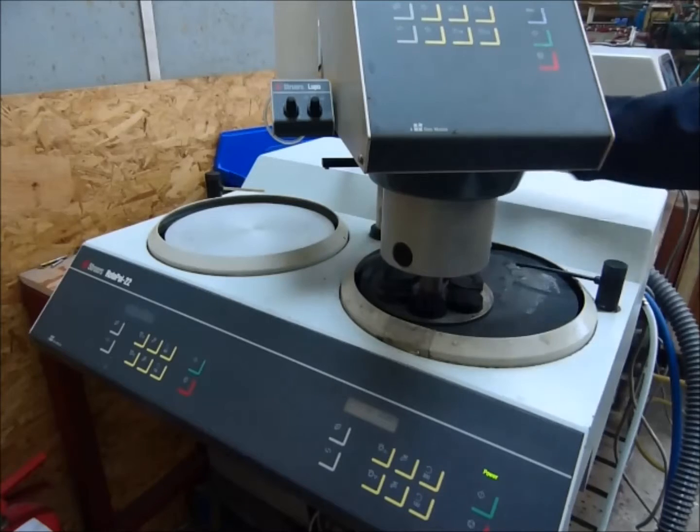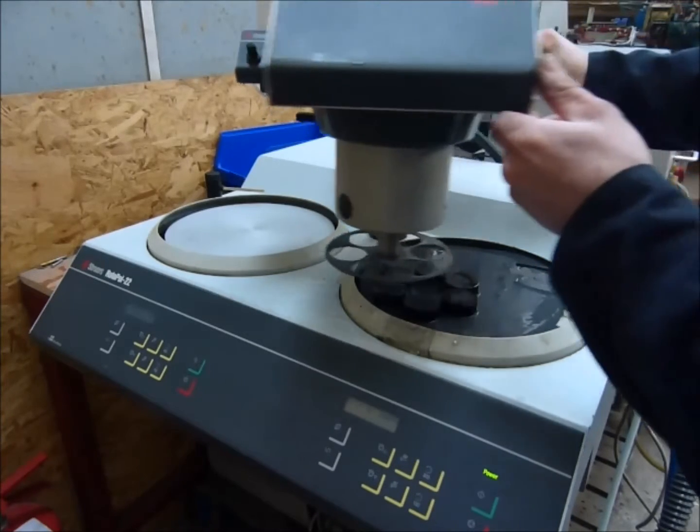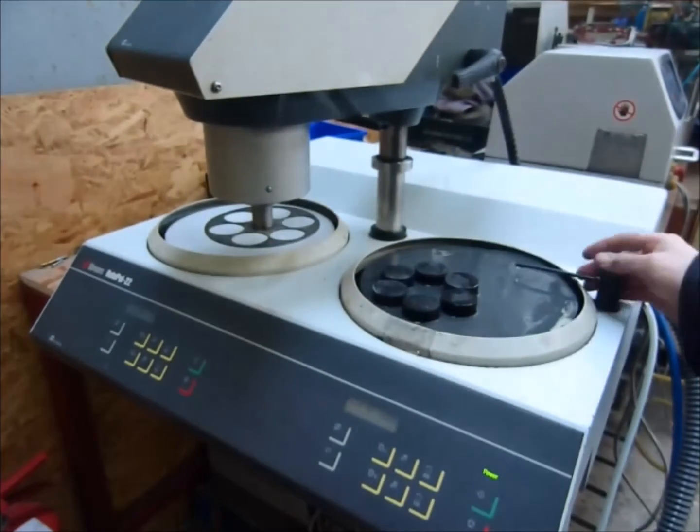That's it, it's finished. Just raise your head up, lock it back into position, and there we go.